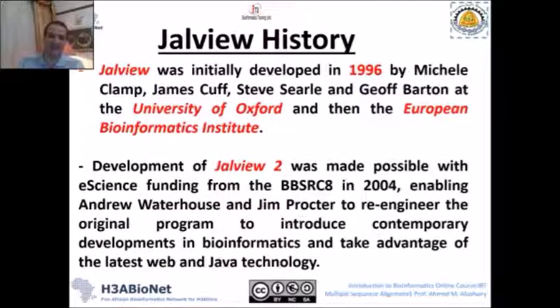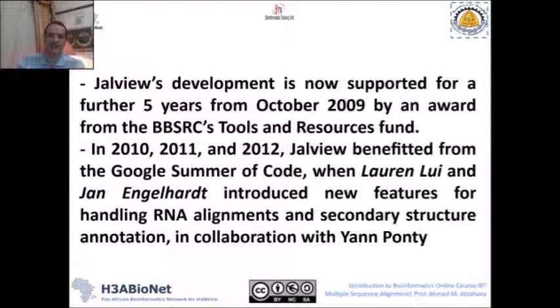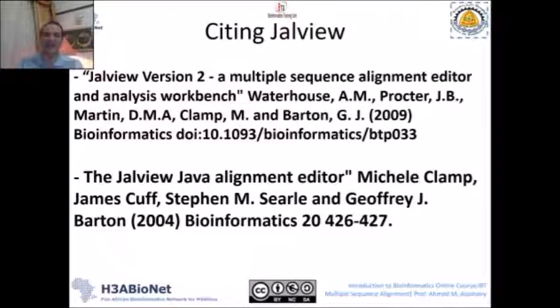The next two slides are only about the history of Jalview. You can see that Jalview was developed in 1996 at the University of Oxford, and you can take a look at the progress of this development. Of course, all the credits now go to the University of Dundee for hosting the Jalview website and for developing more capabilities of Jalview.